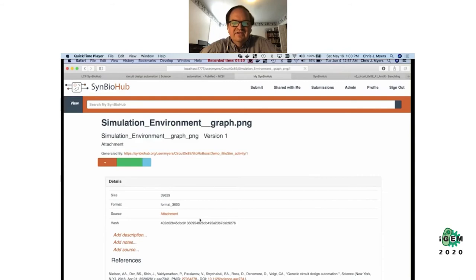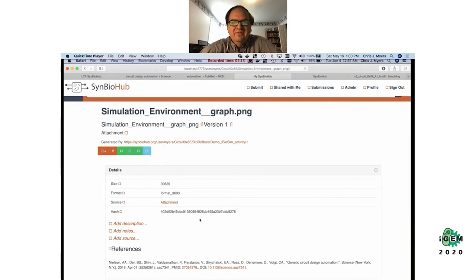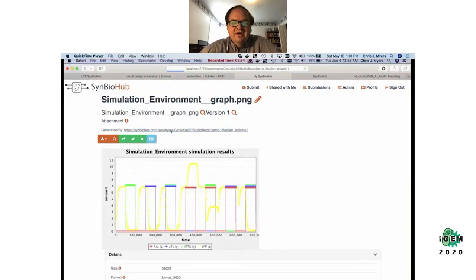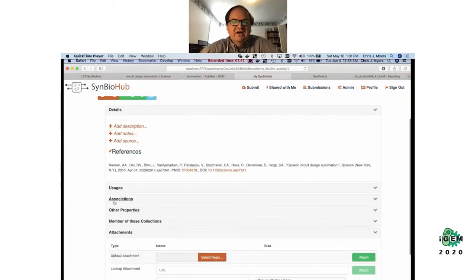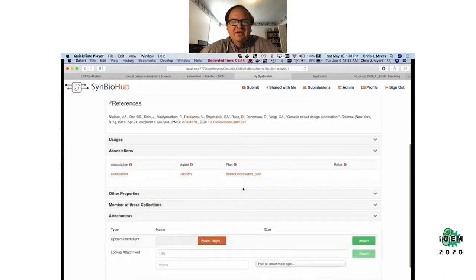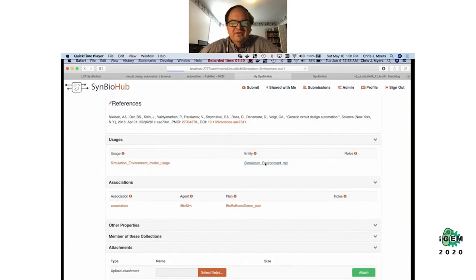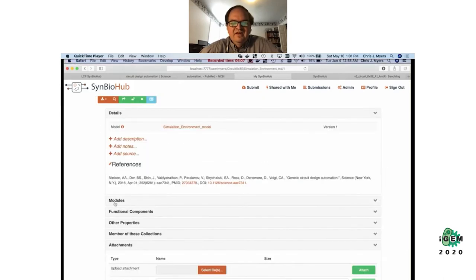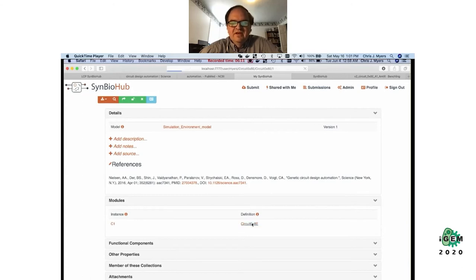This is uploading the entire genetic circuit design along with the model and simulation results. The design is annotated with how the simulation was generated so that it's reproducible — other people can reproduce my simulation to see if they get the same result rather than just trusting a plot in a paper. There's information like what tool it was built with, instructions for doing the simulation, plus the environment model and all the models used.